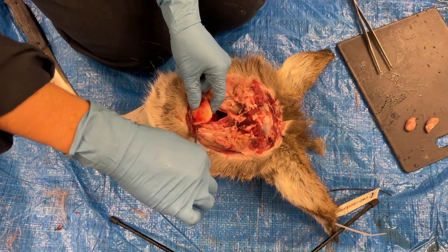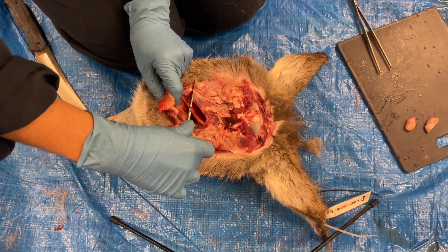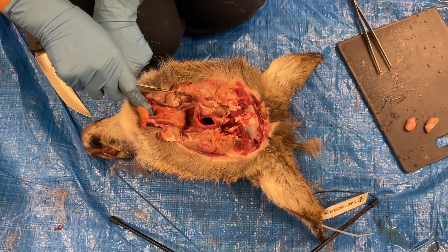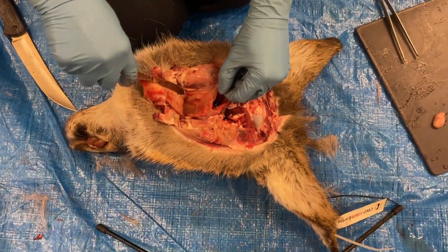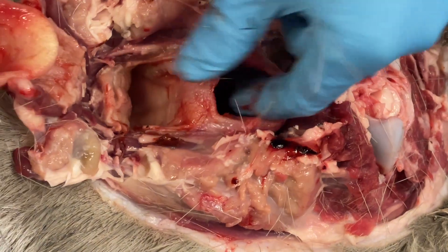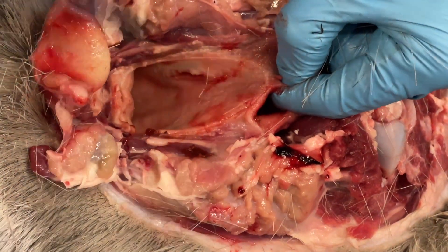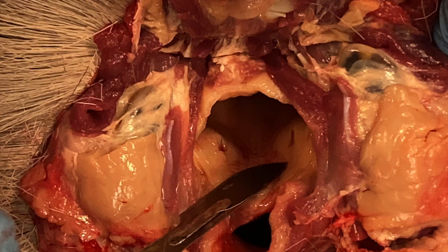There are two entrances: one is the nasal cavity, or the back of the nose, and the other is the oral cavity, the back of the throat. This is where the tonsils are located. If you feel the roof of your mouth — this is the same in deer. Open up the back of the throat and look for two little holes called the tonsillar crypts. The tonsils are located just behind these.